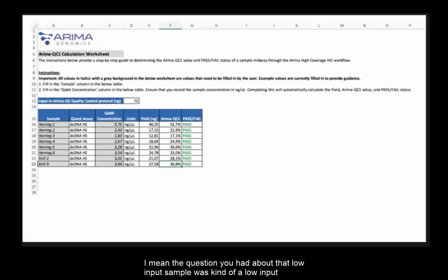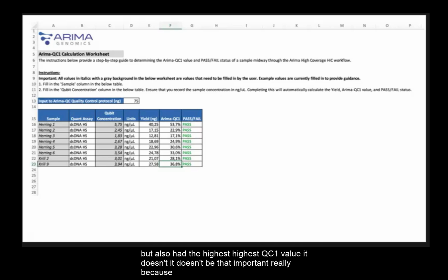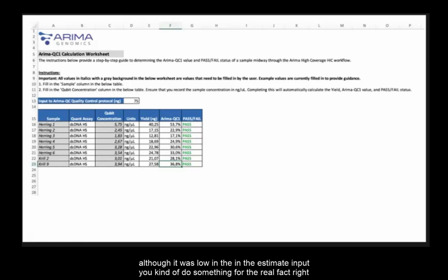The question you had about that low input sample was that it was kind of the lowest one, but also had the highest QC1 value. Yeah. It doesn't need to be that important really, because although it was low in the estimated input, you kind of boost up the input for the real effect, right? Mm-hmm. So if you use 3 times more there, you use the 30% pellet on that one, so we kind of even out the input a bit between the samples. So I think it's just a coincidence that this one is higher than the others, and the most likely reason is that this pellet was treated well during the crushing and through the rest of the process.